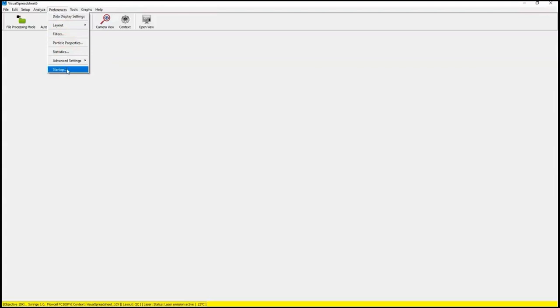By selecting the Open View option in the Tools menu, a new window opens displaying the collage of particle images from an open run or runs. The Classification tool allows you to view a classification, to open a classification template, and to view a library. The Visual AI option is a custom software tool only available with the purchase of Visual AI. A button for OpenView is included in the operation bar for easy access to this function.